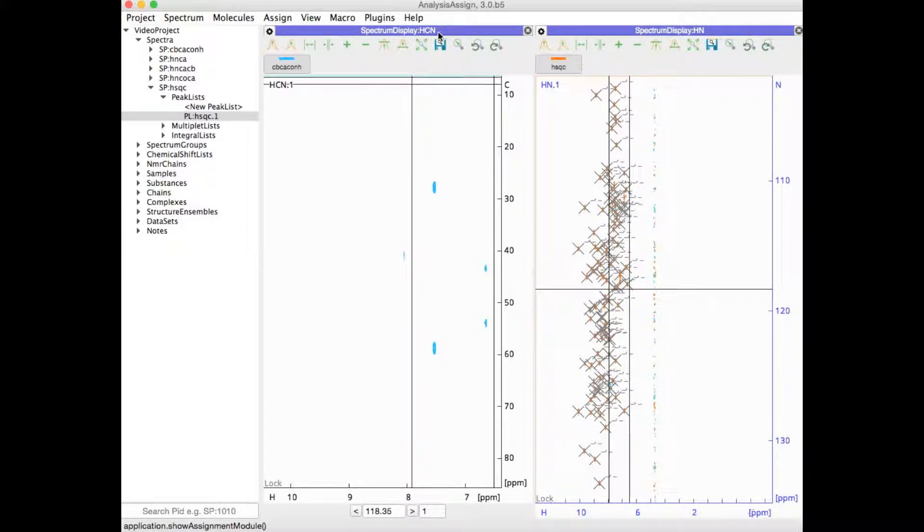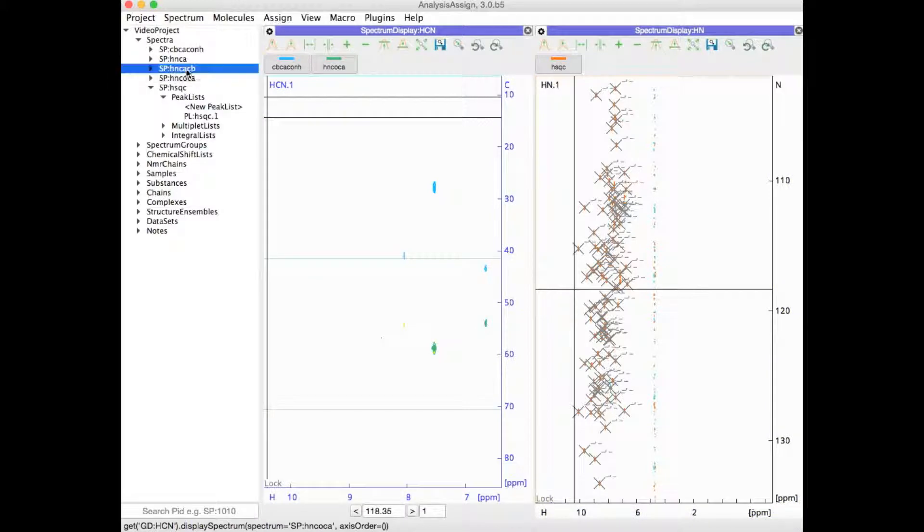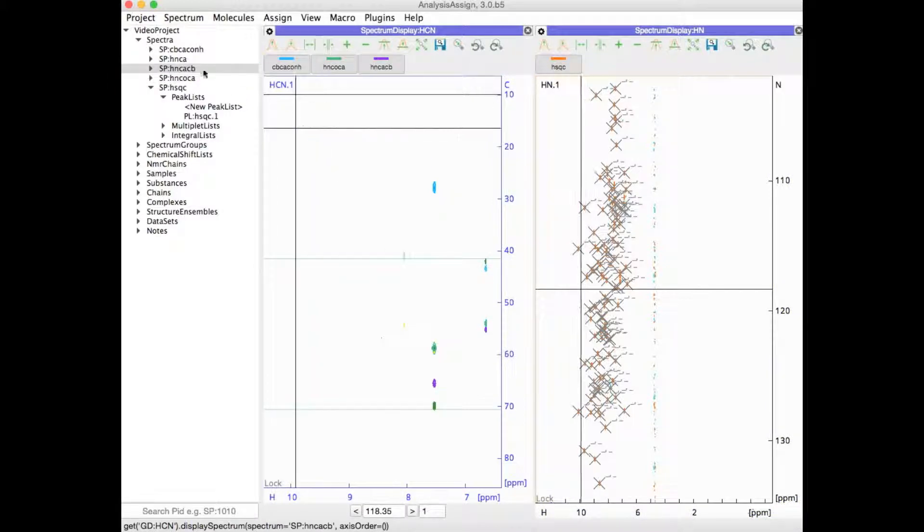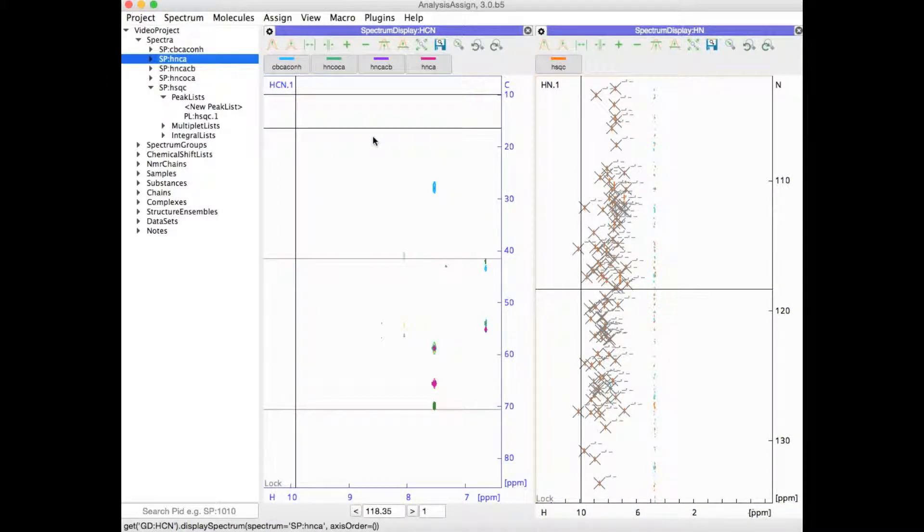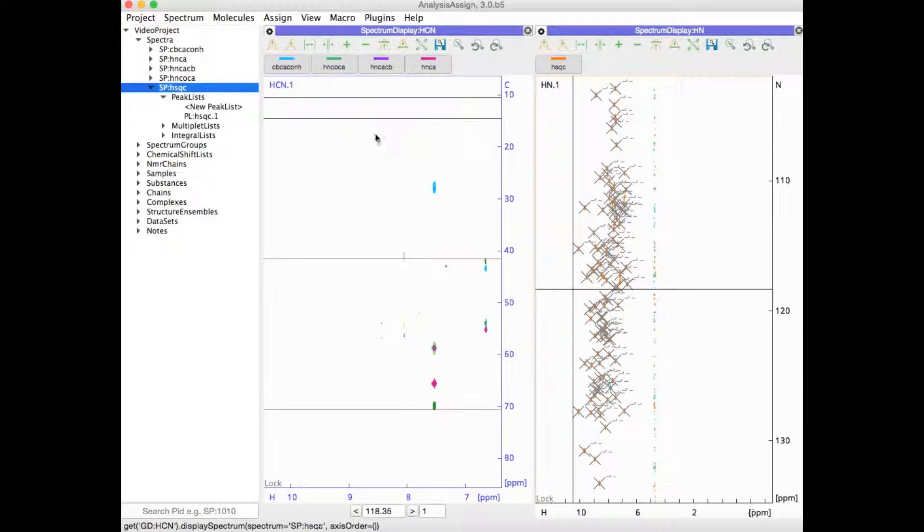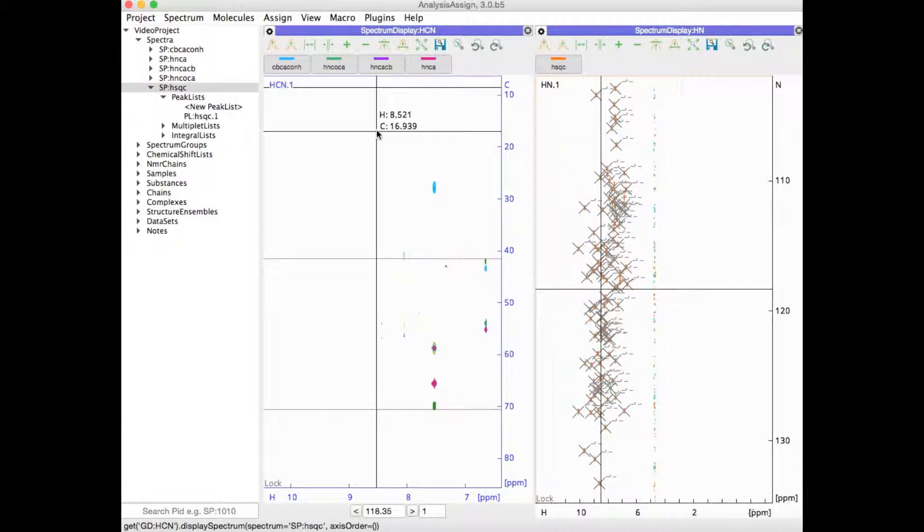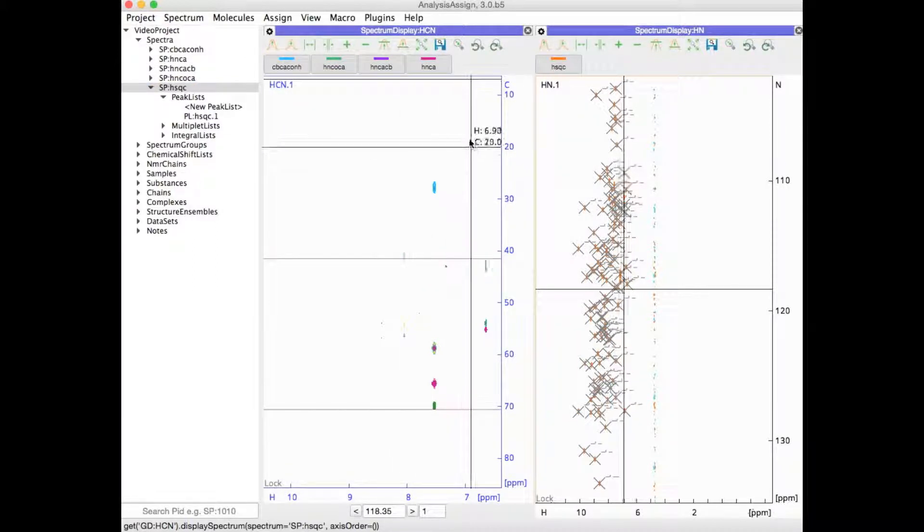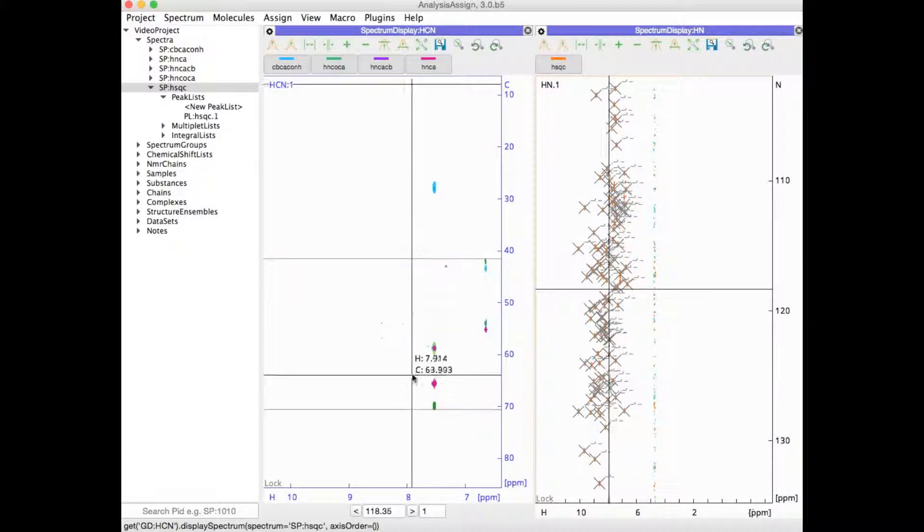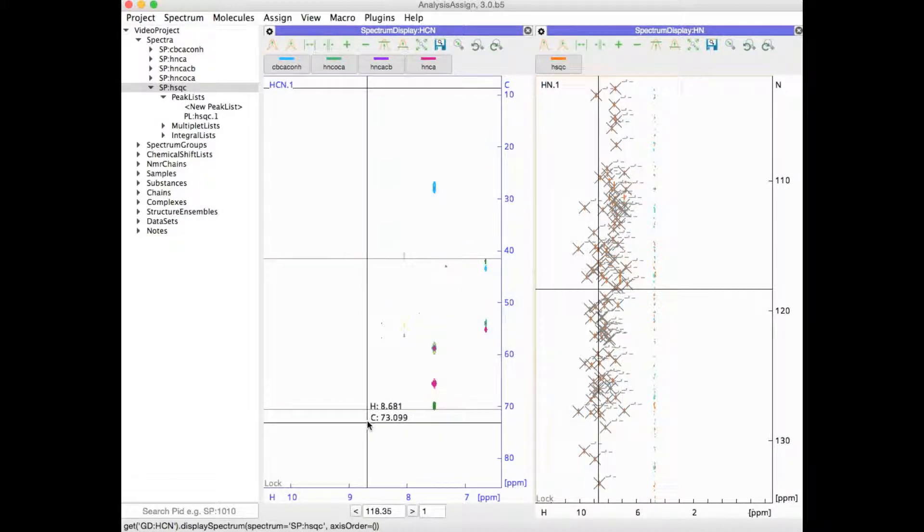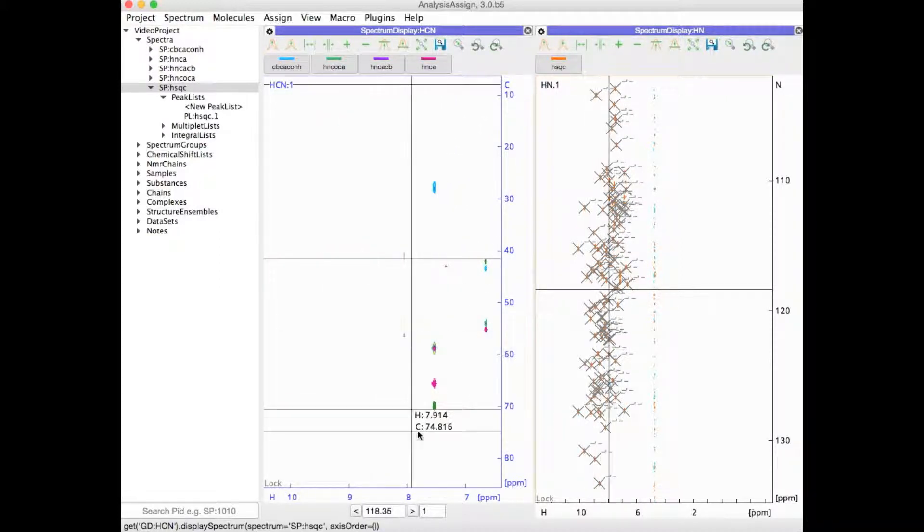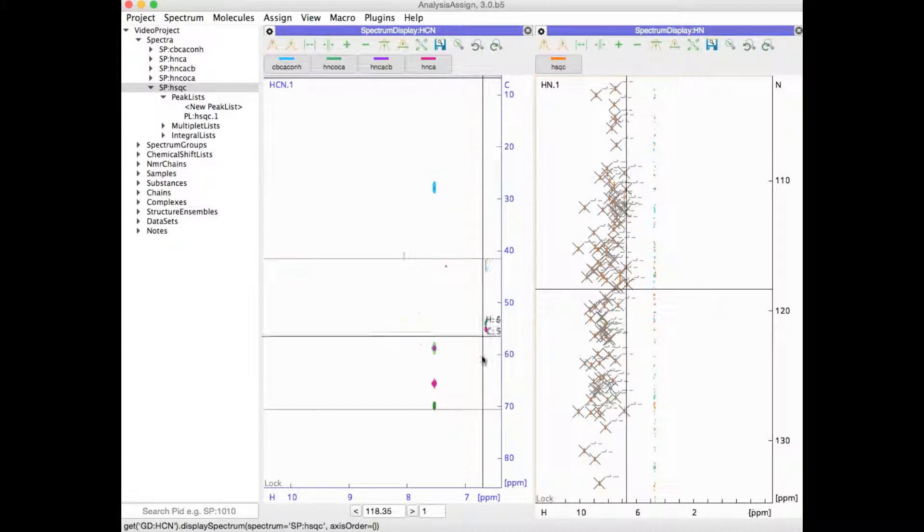The HCN module can take any spectrum which has the correct axes, so I could drag some additional spectra into here if I wanted. Note that if I try and drag my HSQC in here, that won't work because that is an HN spectrum and this module has the nitrogen in the Z axis rather than along the Y axis.